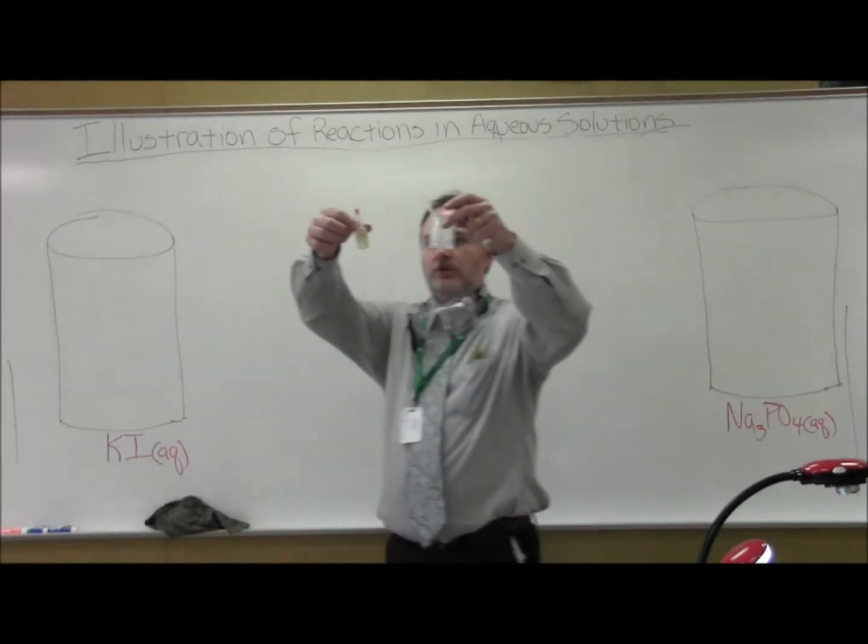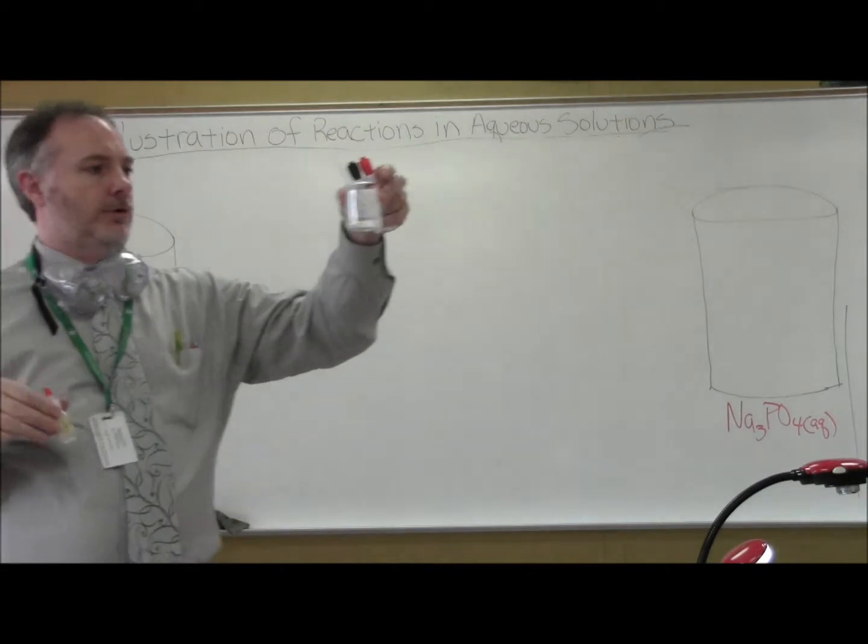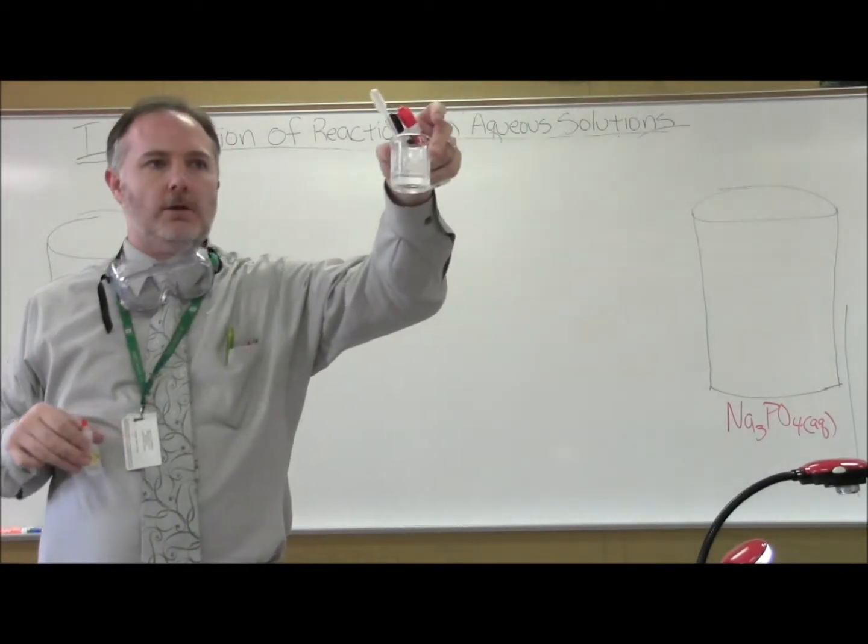And I have the solutions. One of them's in a little squeeze bottle, a clear liquid, and one of them's in a beaker. Okay, I got another clear liquid.